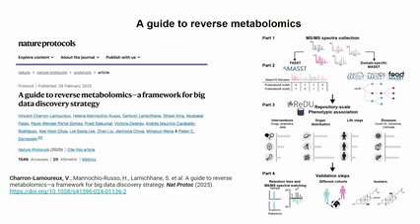We just published recently a paper in Nature Protocols. It's a guide to reverse metabolomics, step by step. So if you don't understand fully everything that is happening today, you can just refer to that protocol. It's a step-by-step guide, and this allows you to perform reverse metabolomics.